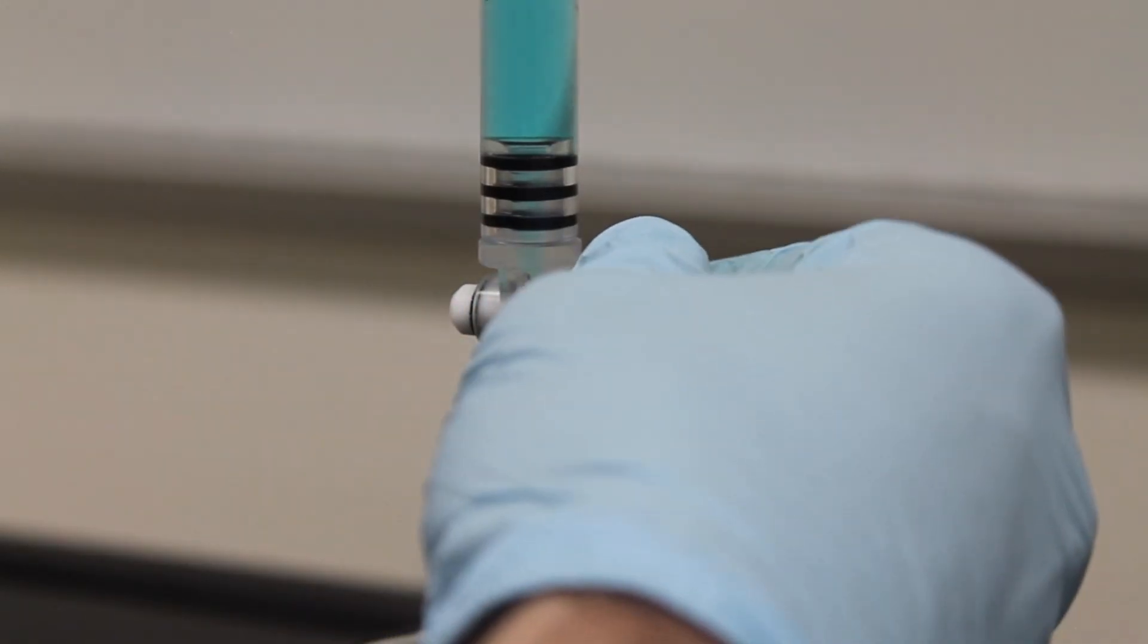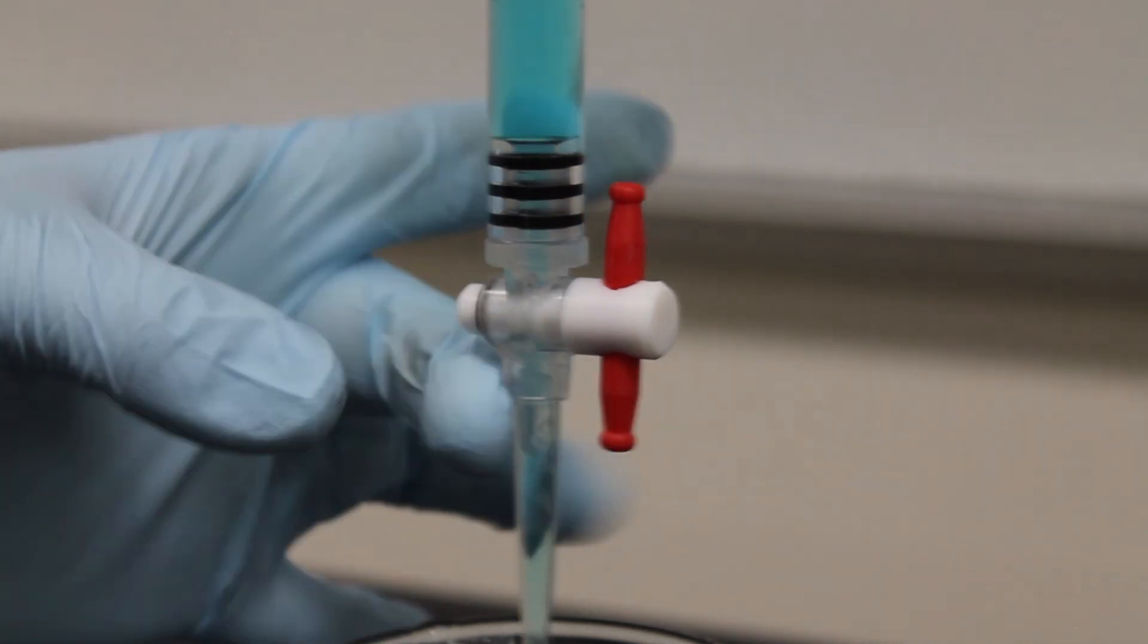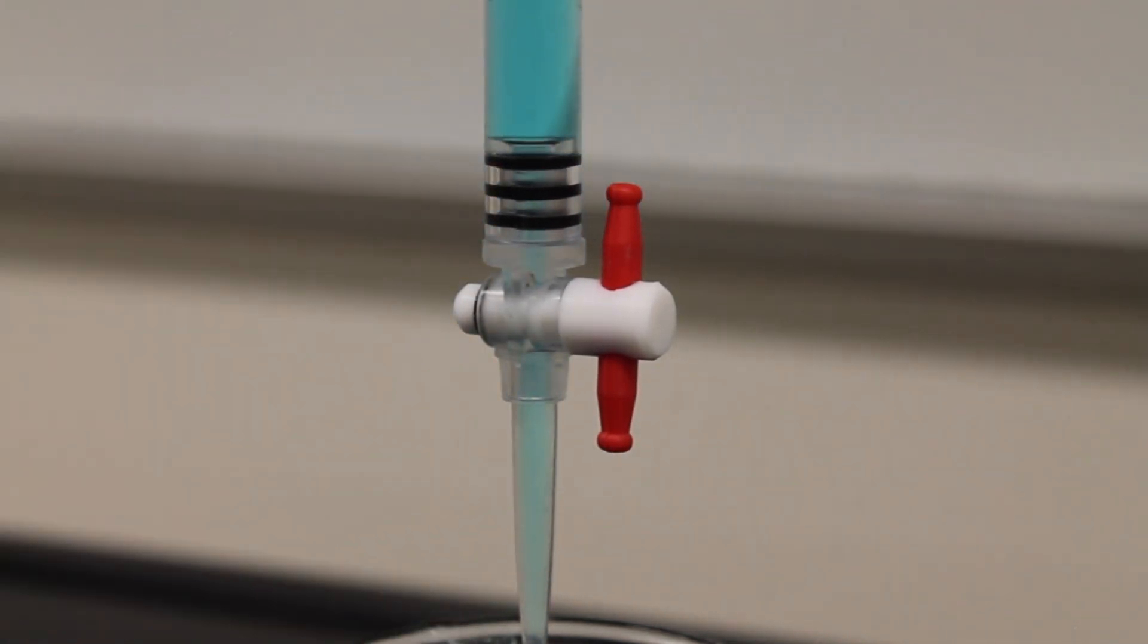Open the stopcock to let a steady flow of liquid through. There are commonly bubbles trapped in the tip of the burette. These bubbles can throw off the precision of your measurements so it is important to get them out. Give the burette a few light flicks with your finger to remove the bubbles. Once the bubbles are cleared turn the stopcock.